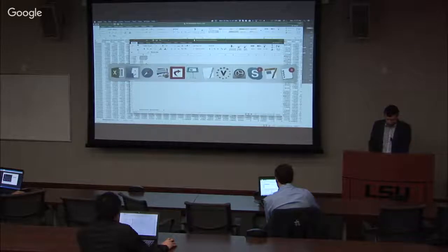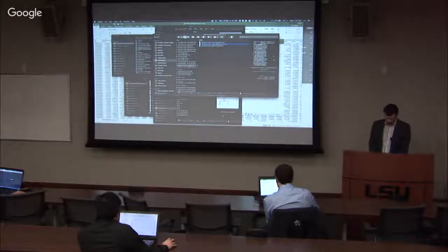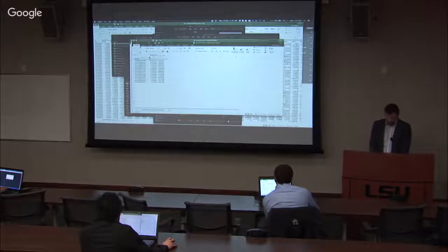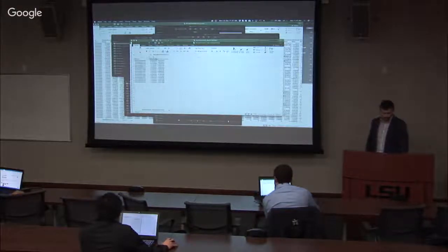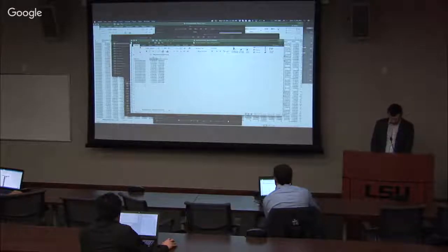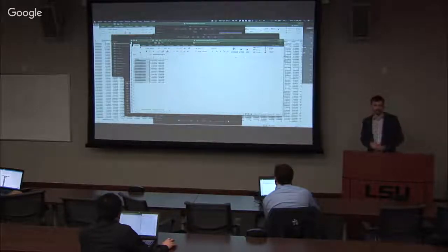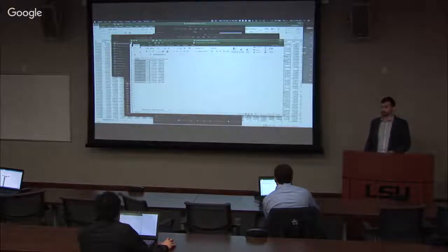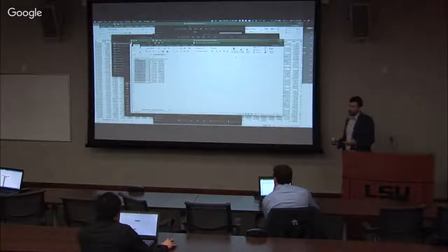But it also gave us, as a result here, the feature importance. And that is really what we are interested in. The feature importance is going to be genes that have a large mean decrease in accuracy. So eliminating that gene from the data set will actually cause the accuracy of prediction to decrease a lot. And now I have a list of my 15 genes, which is how we got the other data set. So this is just a way to select those genes that are going to be most informative for the classification. Now, if I do this many times, this list can improve in its quality. Now, 15 genes is probably not good enough for biological interpretation.